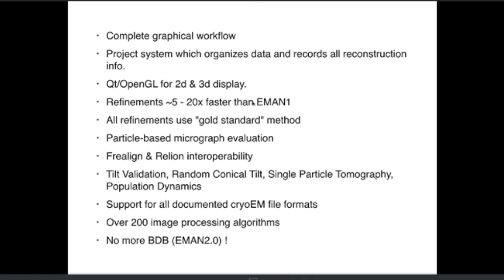This is just a benefit over people who might still be using Eman1. We have made some dramatic speed improvements in Eman2 over Eman1 through optimizations of various processes. So it's well worth switching for that reason.